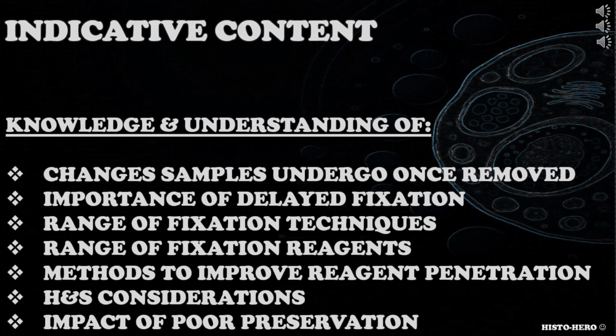Relevant to the health and safety considerations that apply to fixation. Consider COSHH, risk assessments, environmental monitoring, safety data sheets of reagents, PPE. Relevant to the impacts of preservation on patient management and outcomes. Consider interpretive and diagnostic issues, treatment recommendations, subsequent analysis, genetic preservation, antigen preservation.